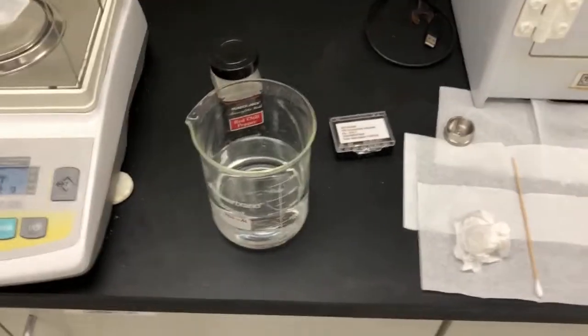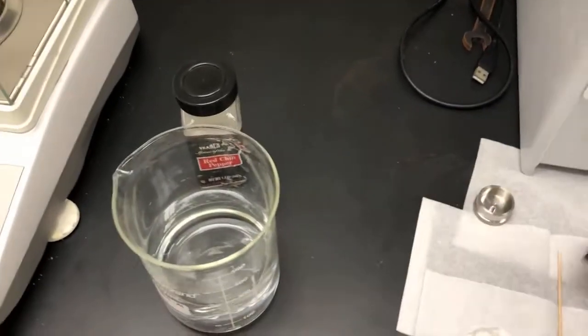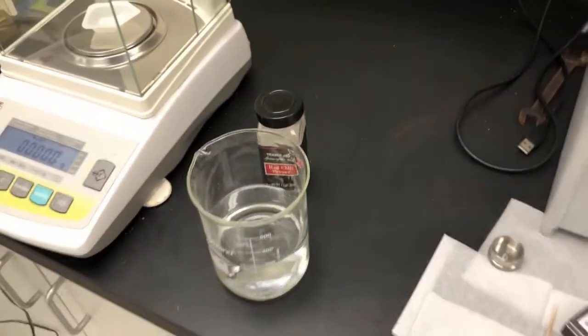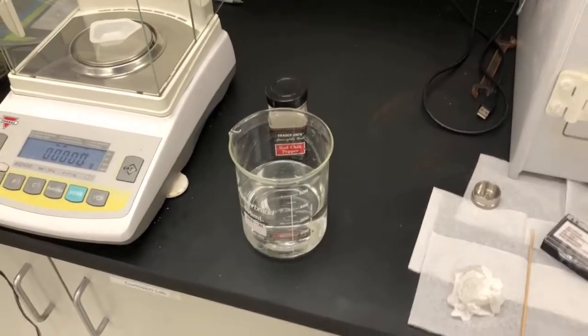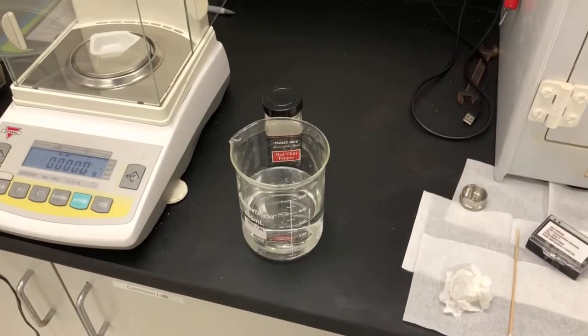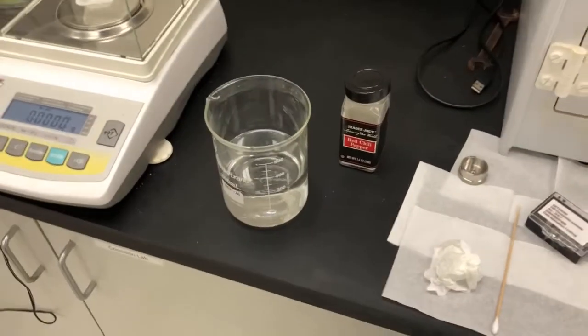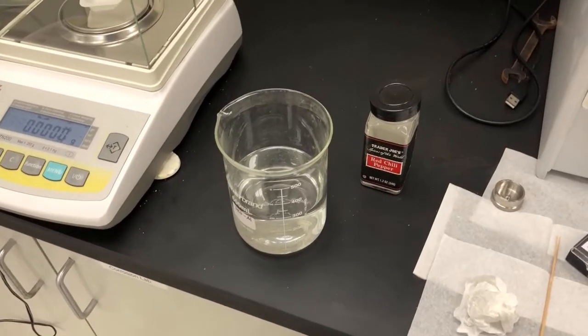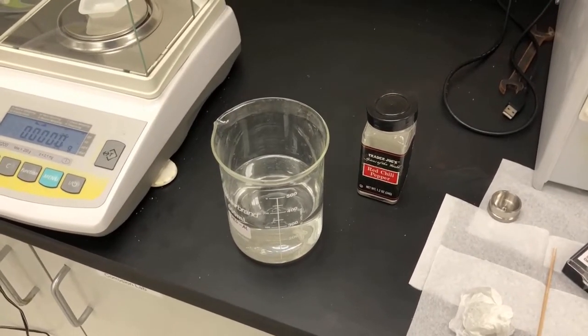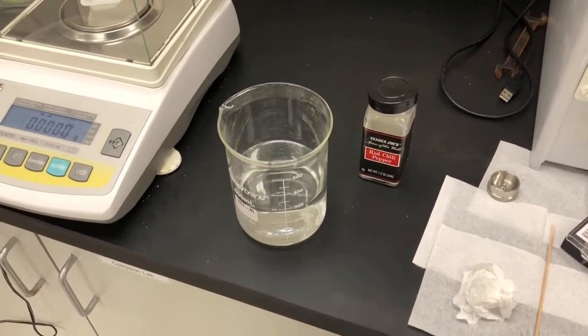Hi everybody, we are at our last experiment for Engineering 45. I know you don't want to go, but you could see me again in Materials 202 or Engineering 110. We're at our last experiment unfortunately, but it's a fun and very useful one if you want to get jobs - creating a galvanic cell to look at corrosion behavior of materials.